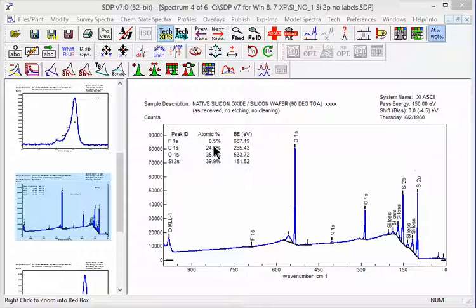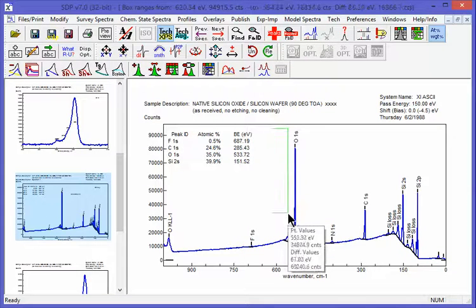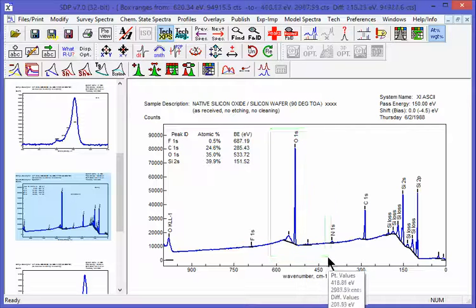In this lesson, number 3, we'll see how to do zooming, undo, and scaling. Put the cursor wherever you want to start an area to zoom. Press the left mouse button, drag, and zoom in. Put the box around what you want to zoom into.